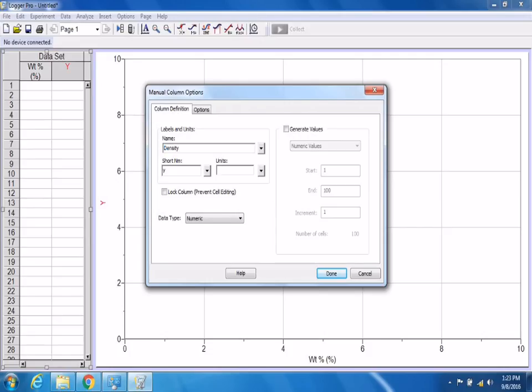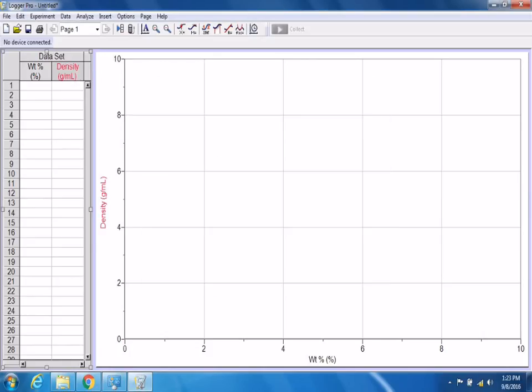And it's going to be grams per mil. And let's just go ahead, our water, weight percent sucrose is going to be 0. Density, we hope it's about 1.00. I'm just kind of guessing these. Let's just go with 2 grams being 2%. I know it's not. 4 grams being 4%. 6 and 8. Of course, they won't be that percent, but I'm just making it.